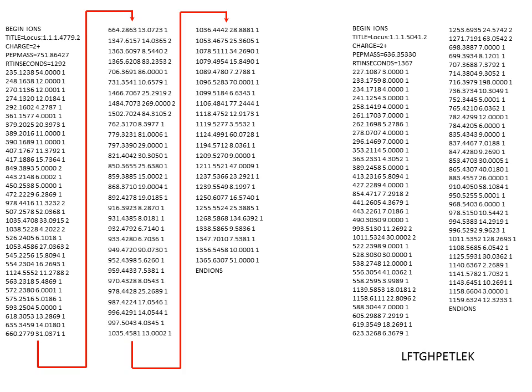We can simplify things by converting the data from the mass spectrometer into a peak list. This generic simple format, often referred to as mascot generic format after one of the database search engines, looks like this. Each intact peptide selected for fragmentation has the beginning and the end of its list defined. The intact peptide mass is noted, as well as the charge on the peptide.